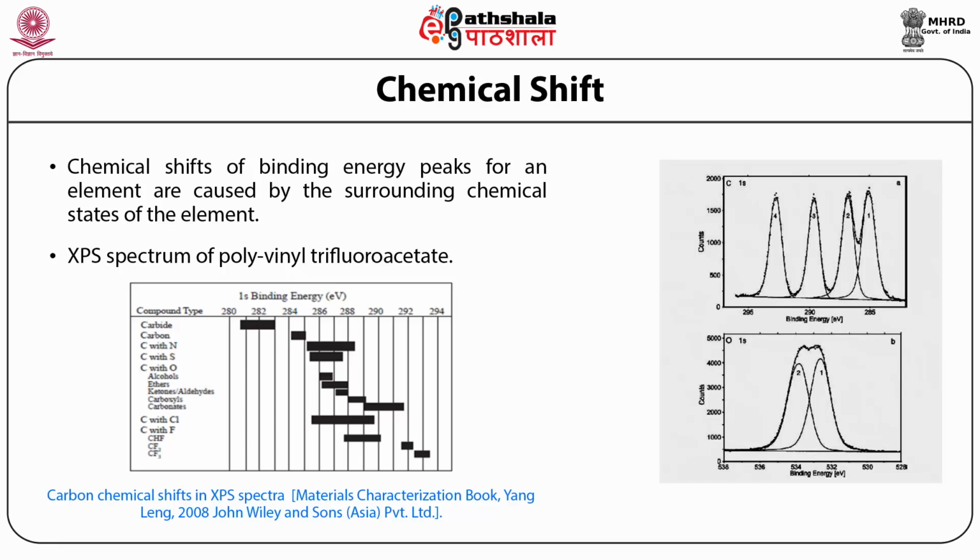Quantifying the amount of chemical shifts in the spectrum can identify different carbon bonds. The binding energy difference between C-C and C-O is about 3 electron volts. This is extremely useful for identifying polymers by revealing various carbon bonds. Also, the chemical shifts reveal the degree of oxidation in molecular solids. Higher chemical shifts occur for a larger number of electrons transferred.